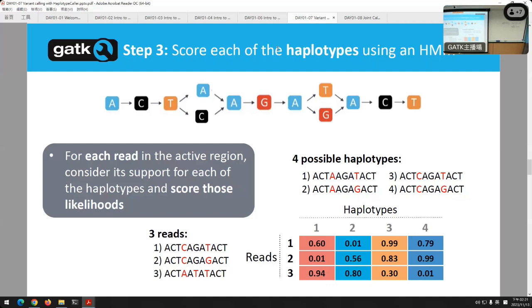But who knows if that difference could be low quality. It could be that this base was a Q10, whereas it matches on the first A, and that A could be a Q40. That's where the base qualities come in. It's a good question, a toy example, but these things really happen. Other questions?